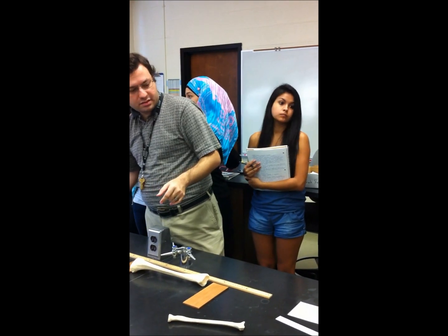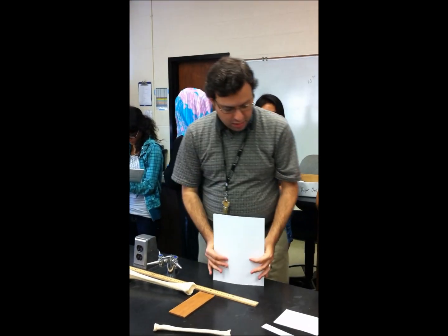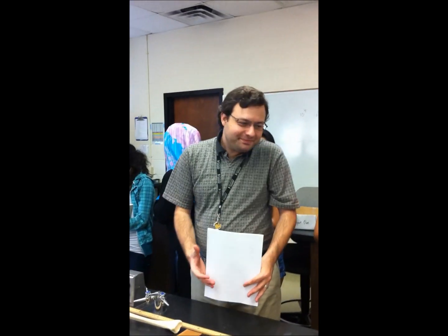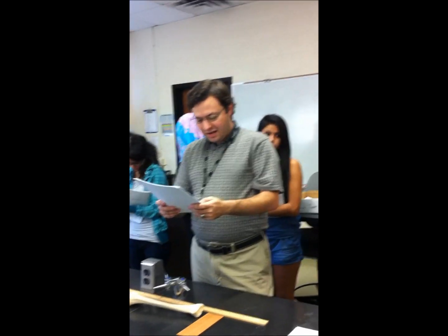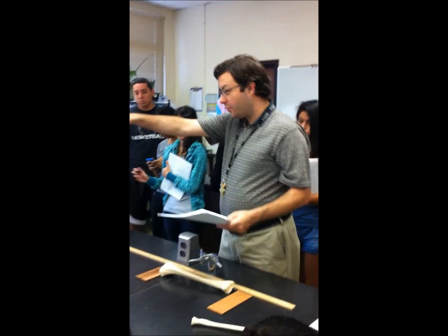Yes? Is there, for length, do we measure to millimeter? No. Yeah. Well, remember, 1/10 of a centimeter is a millimeter. So. Okay, so that takes care of all of the lab number 1. We have to go to this table right here to get to lab number 2.